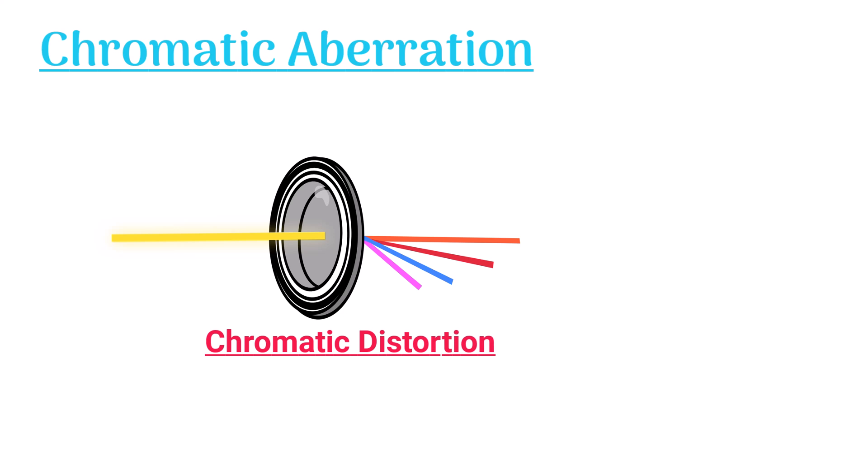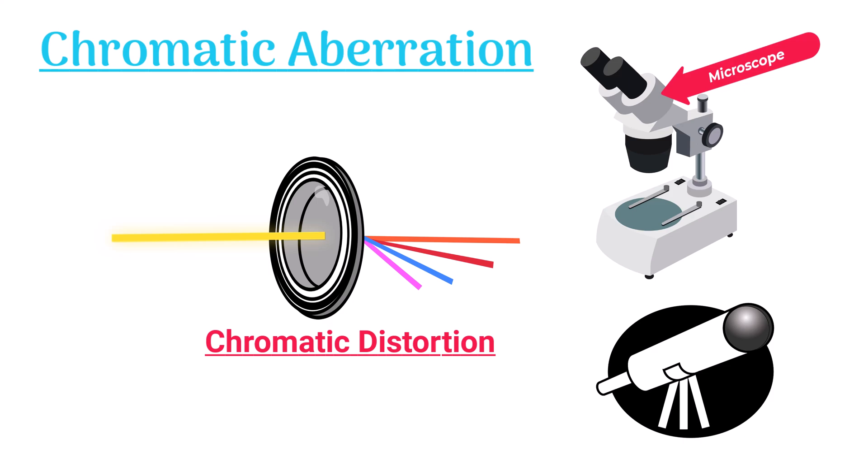Chromatic aberration, also called chromatic distortion, is a weird glitch commonly seen in microscopes and telescopes.